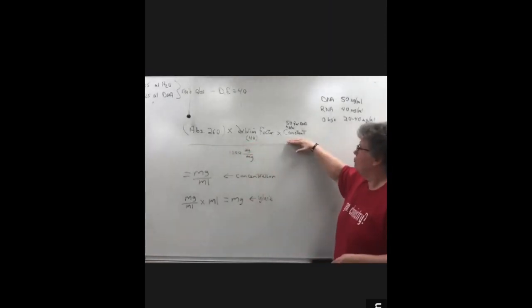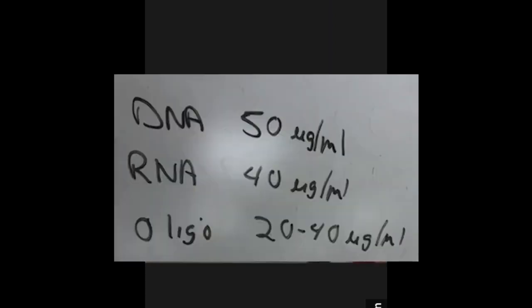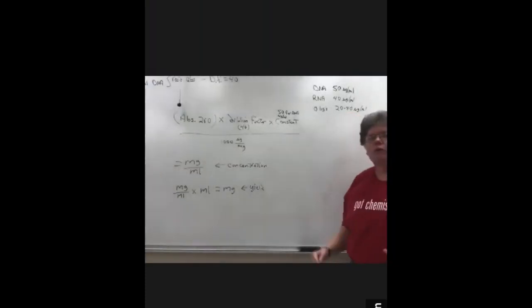You want to relate it to a constant, and the constant can be, for DNA, 50 micrograms per mL, for RNA, 40 micrograms per mL. If you are measuring oligonucleotides using this procedure, the constant will range between 20 to 40 micrograms per mL. And actually, when you order oligonucleotides, there's usually a little spec sheet that comes with it that will tell you what absorbance ratio to use.